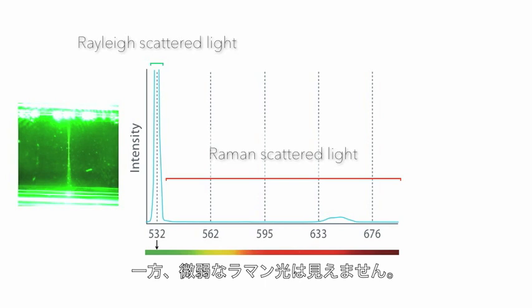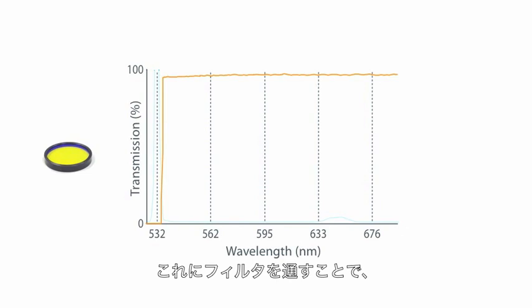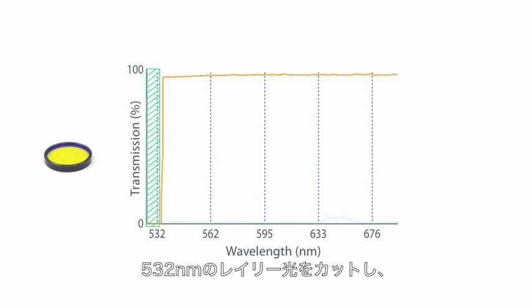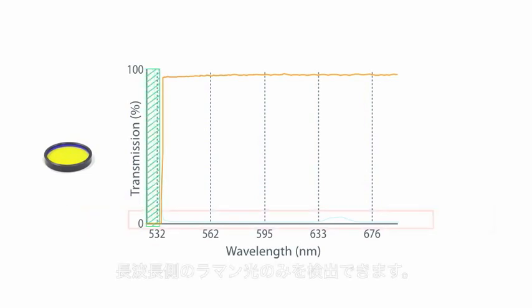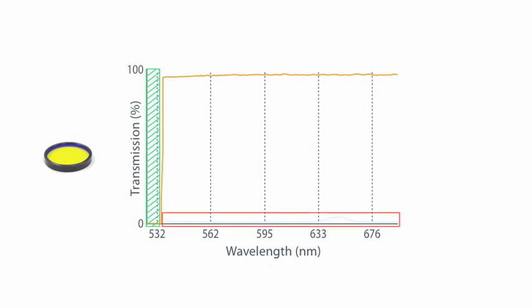Raman scattered light, on the other hand, is too weak to be seen. Next, by using the filter, Rayleigh scattered light at 532 nanometers is blocked. Now the Raman scattered light emitted at a longer wavelength is visible.